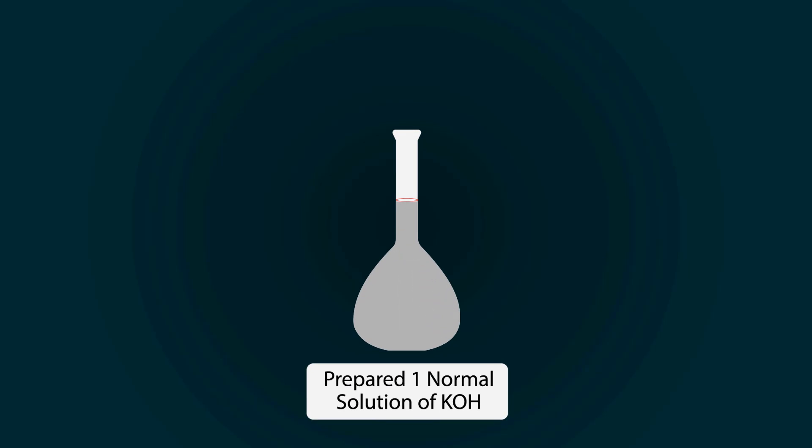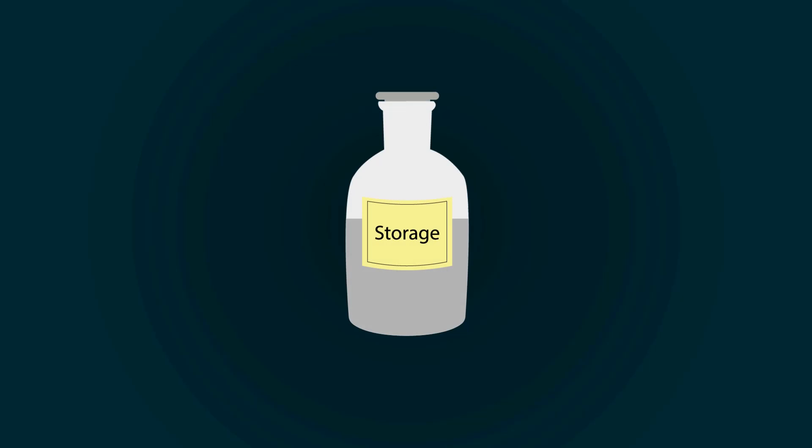We have successfully prepared one normal solution of potassium hydroxide. You can store it in a storage bottle.